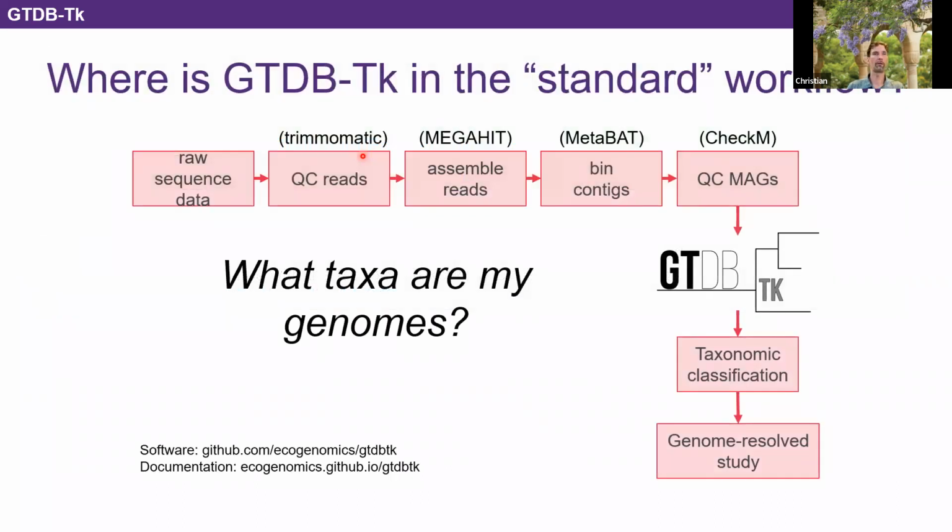Basically, after you have your quality check next, I think you've seen in the past: we get the reads, QC, assemble, bin them, and then run QC with CheckM. There's also a new version, CheckM 2, coming out to assign the quality of MAGs.